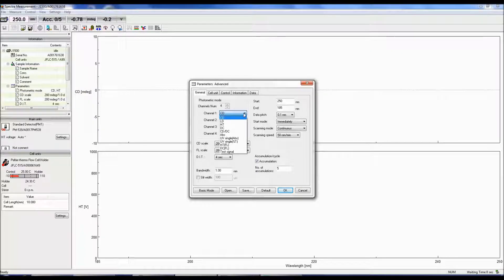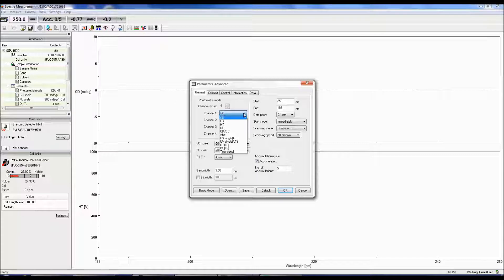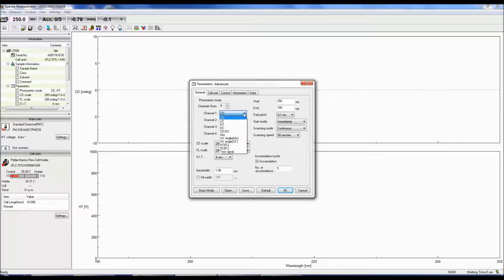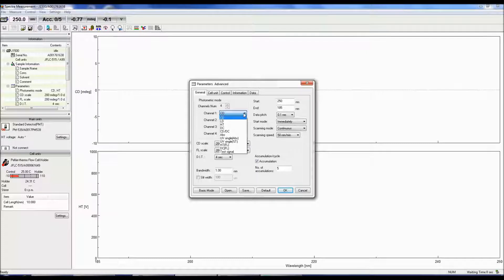Both HT and DC modes monitor the photomultiplier tube voltage. HT is the high tension voltage and controls the gain. Gain is the amount of current output for the number of photons reaching the detector.